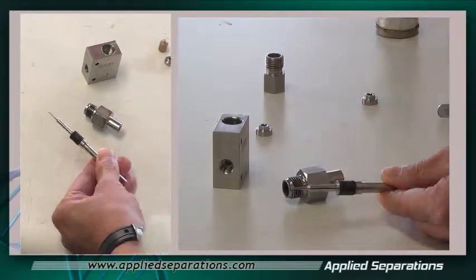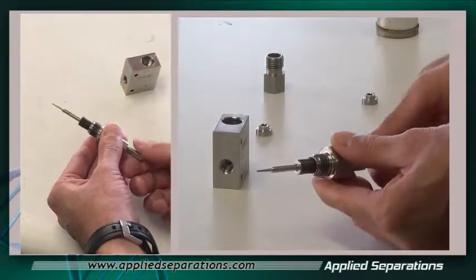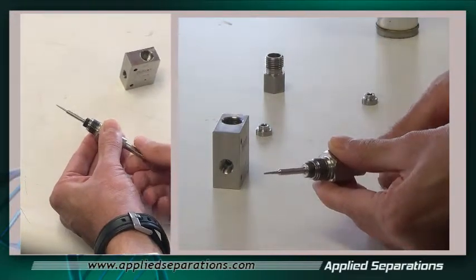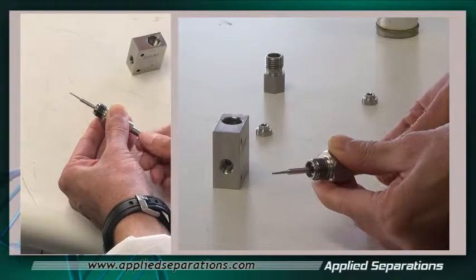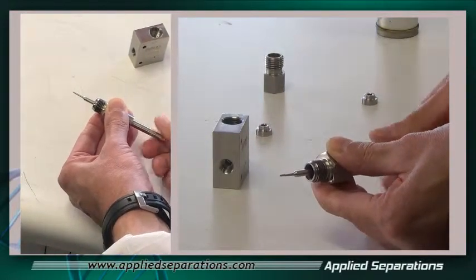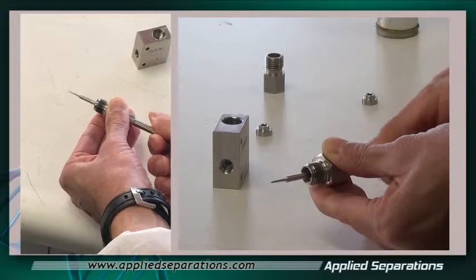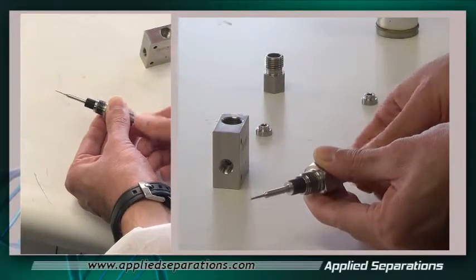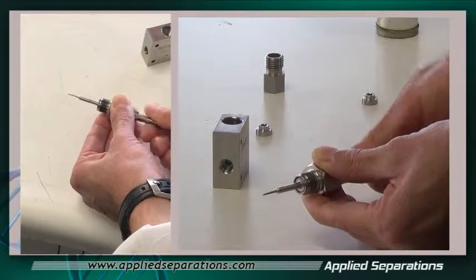Once you get a coating on the threads, insert the new stem into the stem nut by reversing the way we took out the original stem — so we want to go counter-clockwise. As we're screwing in the new stem, the lubricant works through all the threads. It's important to make sure all those threads are covered with anti-seize. Go all the way in, then back out to make sure the grease is evenly distributed, then go all the way back in. The stem is all the way in.